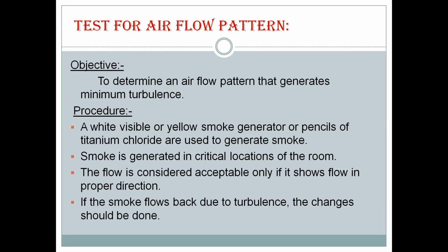Then the test for airflow pattern. In this case, the objective is to determine an airflow pattern that generates minimum turbulence. Procedure: a white visible or yellow smoke generator or pencils of titanium chloride are used to generate the smoke.